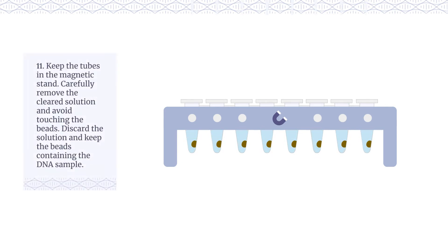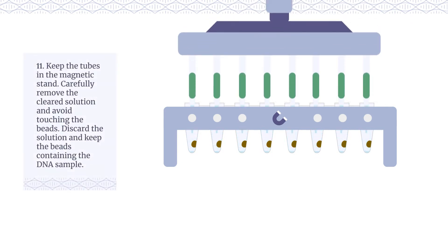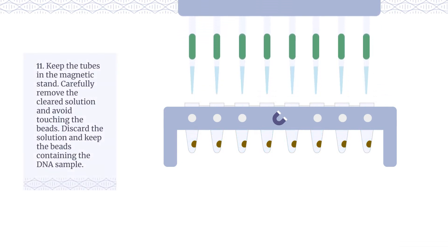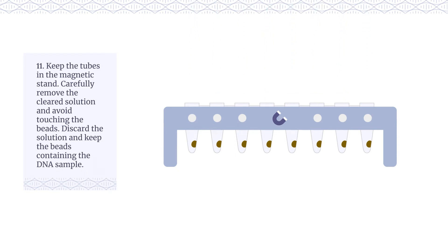Keep the tubes in the magnetic stand. Carefully remove the cleared solution and avoid touching the beads. Discard the solution and keep the beads containing the DNA sample.